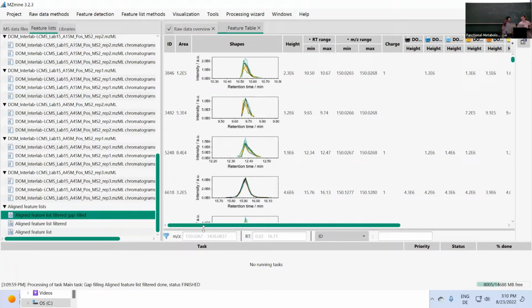And afterwards, this is now all the major steps that we do during the processing. Some people might do a little fewer steps, but overall, MZmine offers many different modules that can work off the aligned feature list that we now have, to either export and pipe the results into data platforms like GNPS, for annotation or metabolomics, or just your R pipeline that you have locally, or we could do some annotation in MZmine.